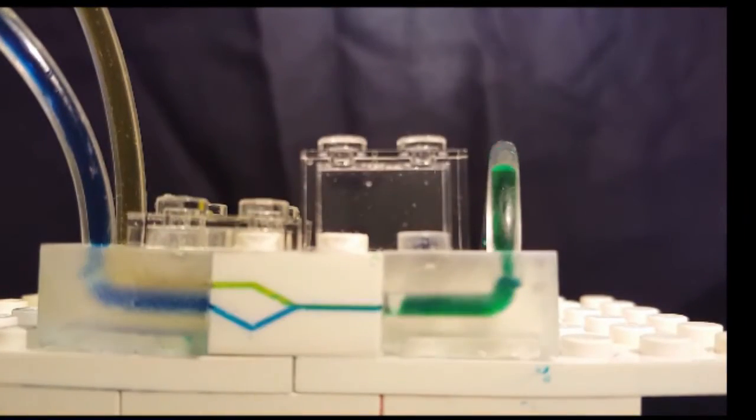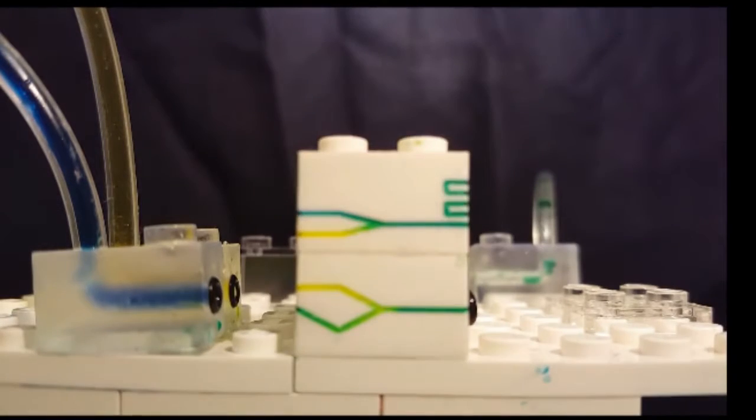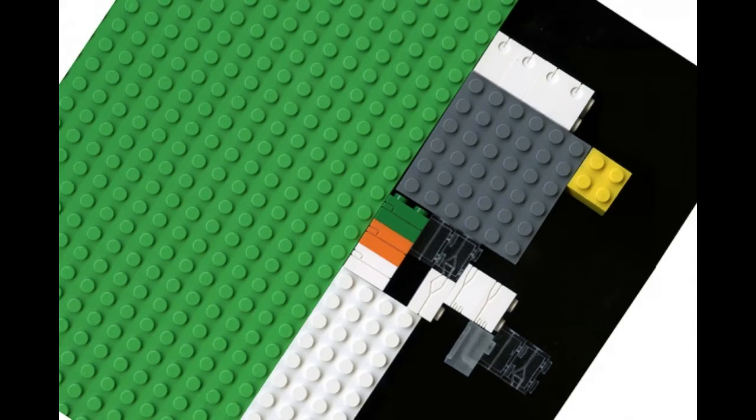Now the MIT team, looking beyond such lab-on-a-chip designs, has found an alternative microfluidic platform in interlocking injection-molded blocks, i.e. Lego bricks.